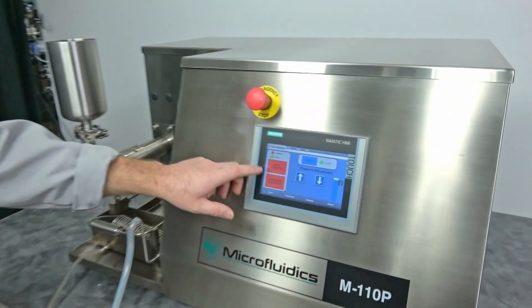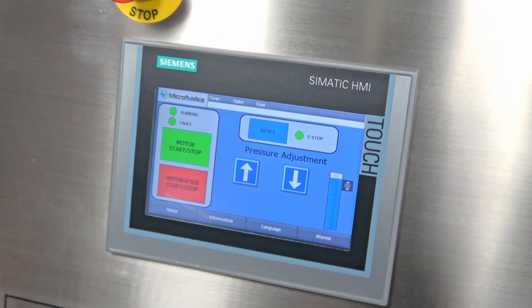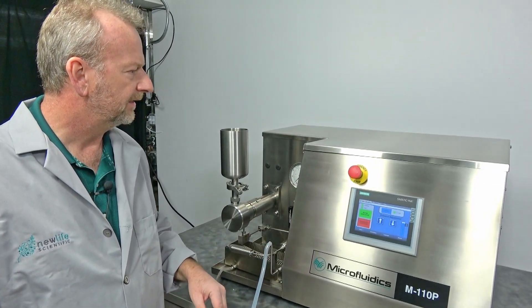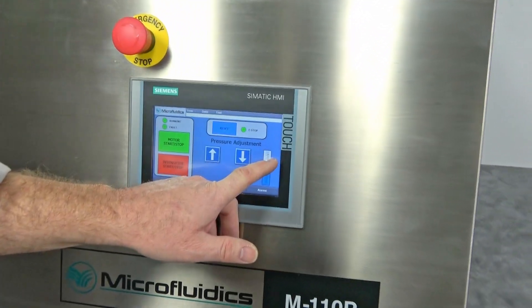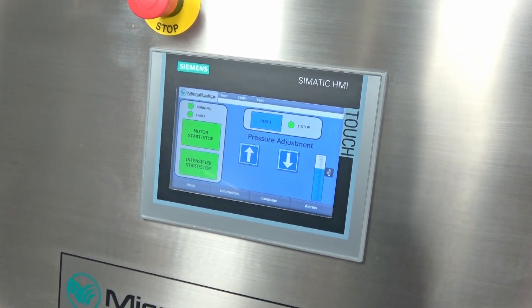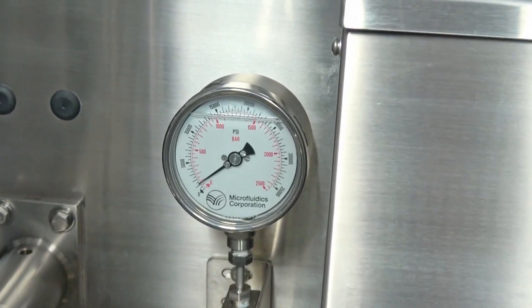We'll go back to the home screen. The first thing we do is hit motor start. It's a super quiet machine — the newest generation did some things to make it even quieter than older machines that just have push buttons without the touchscreen. After that, you can set your pressure, but you really don't know your pressures until you get it started. Go ahead and turn the intensifier on — you can kind of hear it — and you can see the gauge; we're at about 25,000 PSI. I'll turn the slide down a little bit.